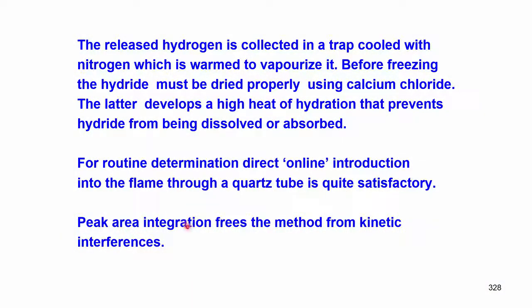So the idea is that peak area integration we can do because of the problem with hydride generation. I had told you that the rate of reaction is very slow, and then it has to be mechanically transported.